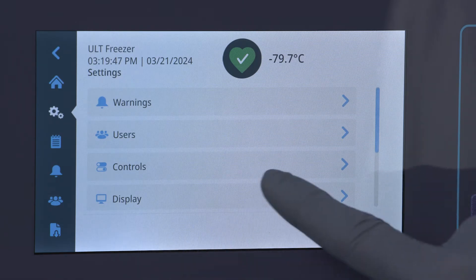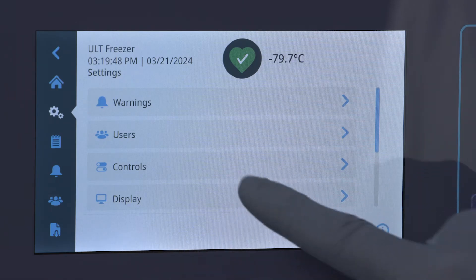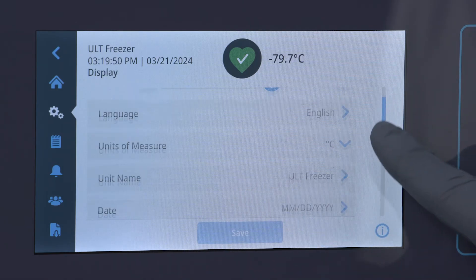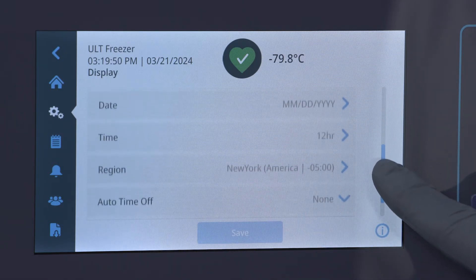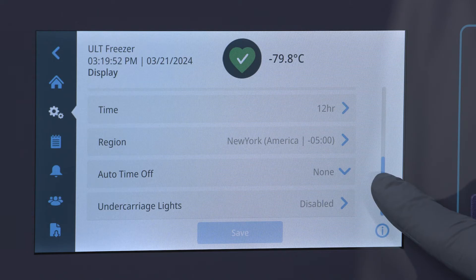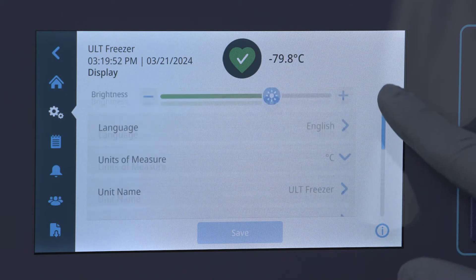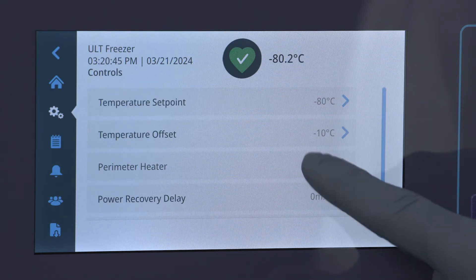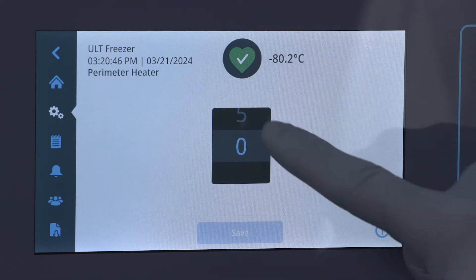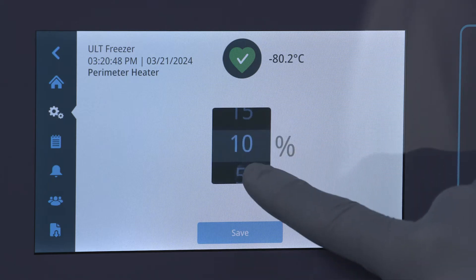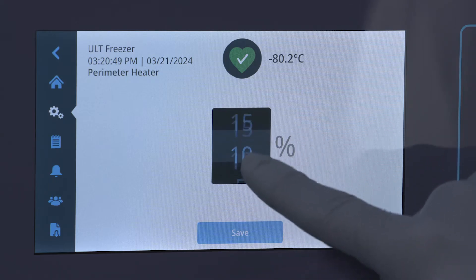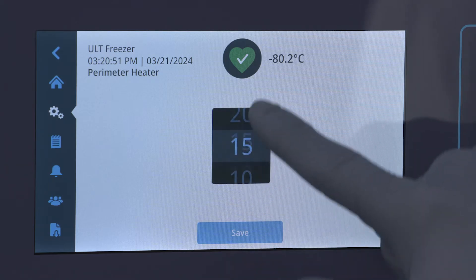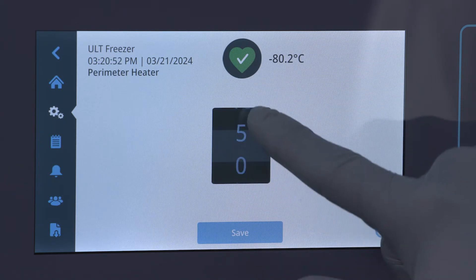In the settings menu you'll find various settings from unit and warning set points to other display settings. An adjustable perimeter heater setting has also been added, which can be used to reduce potential frost and ice buildup on the exterior door gaskets.